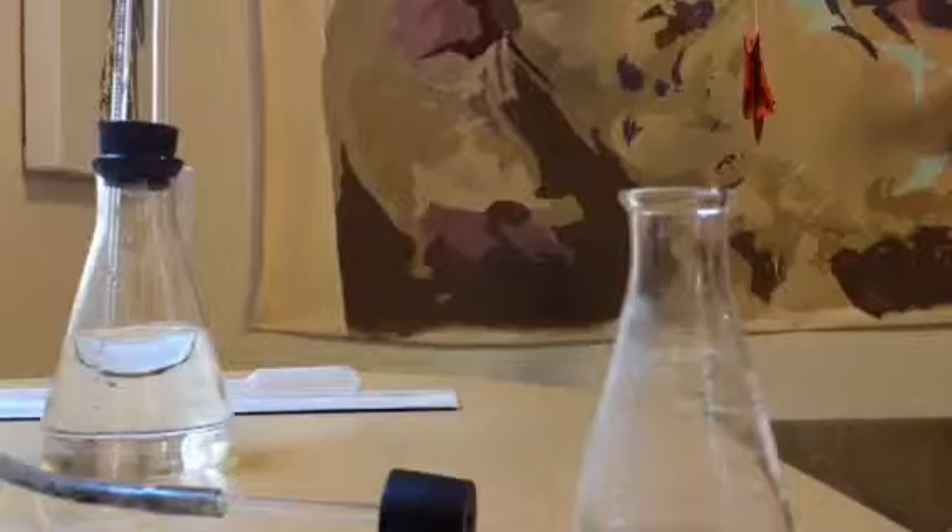Let's see what happens when I put them together. I'm just going to show you the reaction and then I'm going to give you a photo of the after picture — so the measurement in the graduated cylinder.